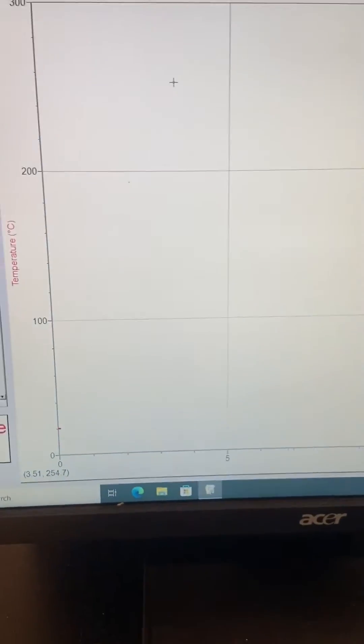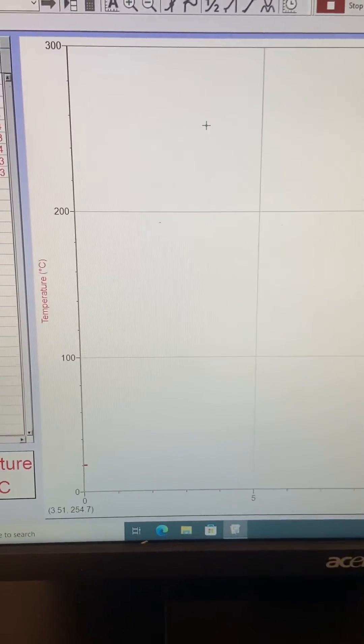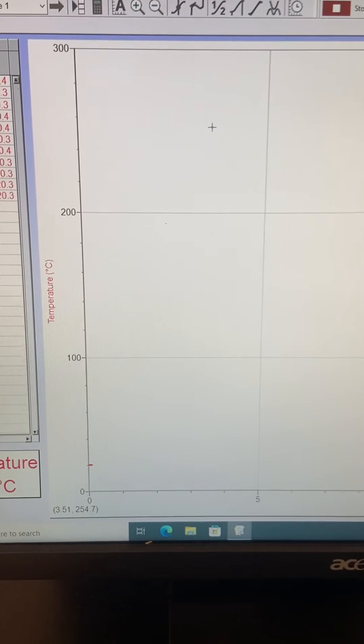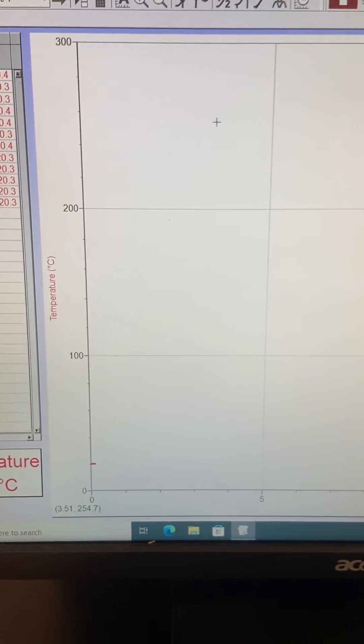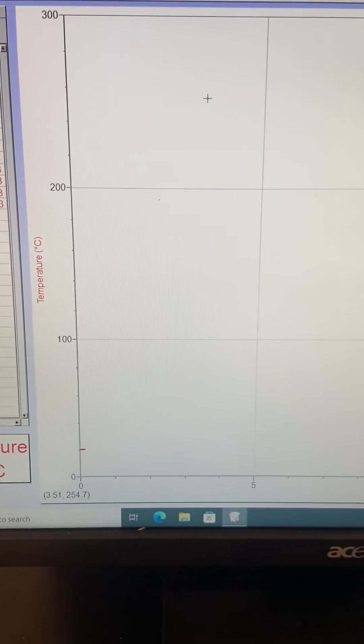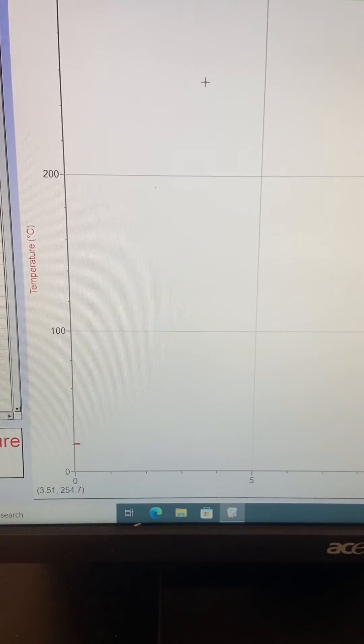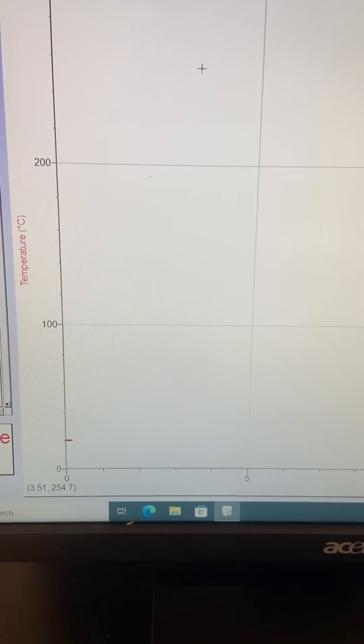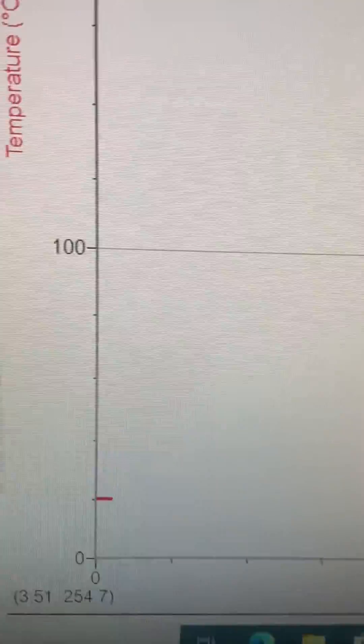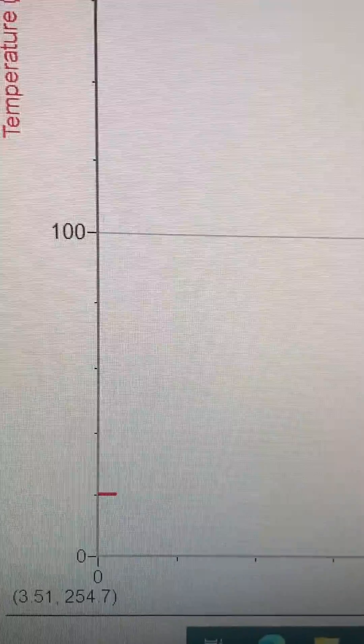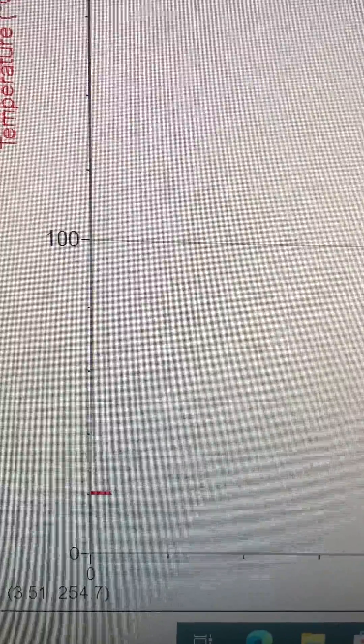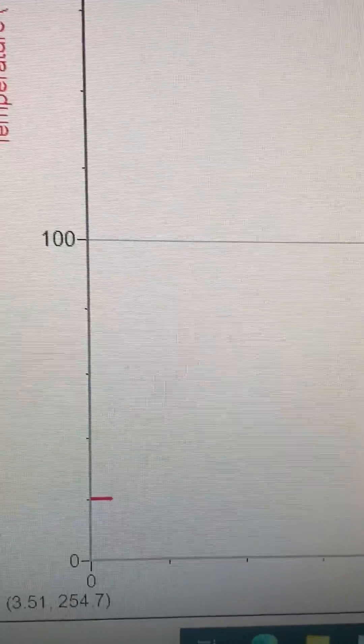The vertical axis is temperature. The horizontal axis is time. You can see the very short delay over here. The unit is minute.